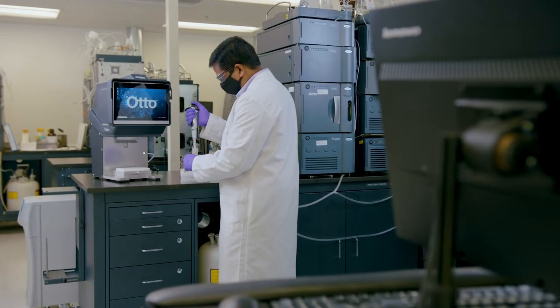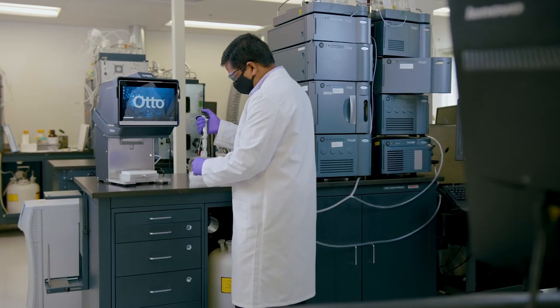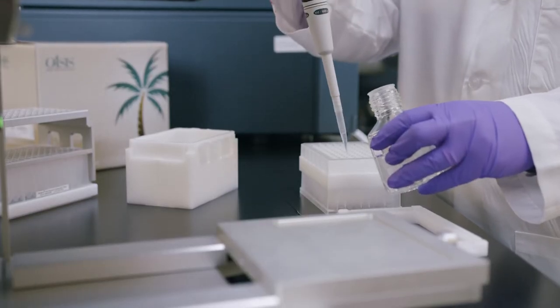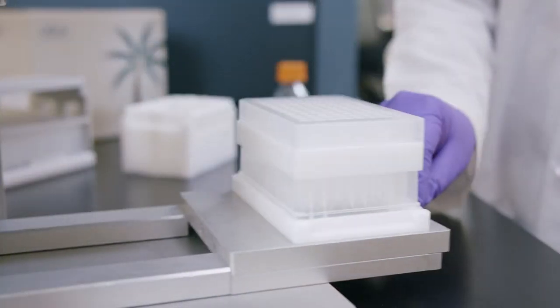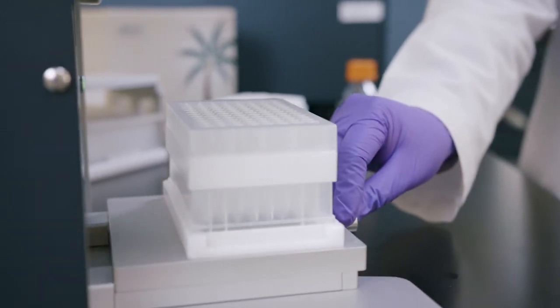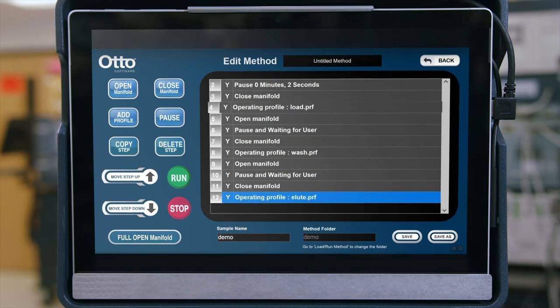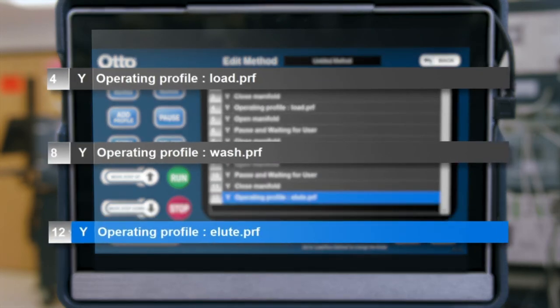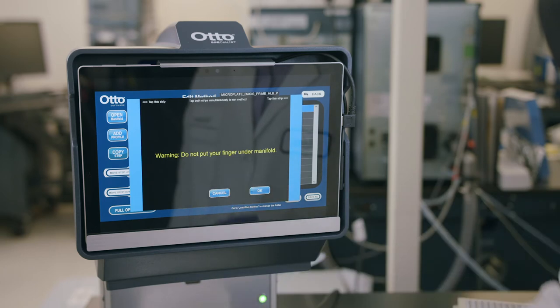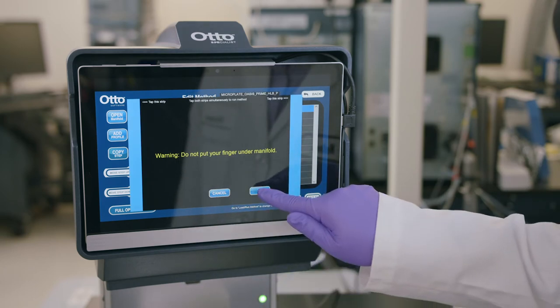After your pressure profiles are created, you can build your SPE method. For each step of SPE, there should be an optional User Alert, a Manifold Close command, a Pressure Profile, and a Manifold Open command. If your procedure calls for one load, one wash, and one elution, this means the step should be repeated at least three times. Once your method creation is complete, you're ready to start processing SPE.